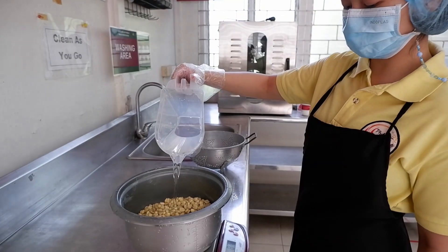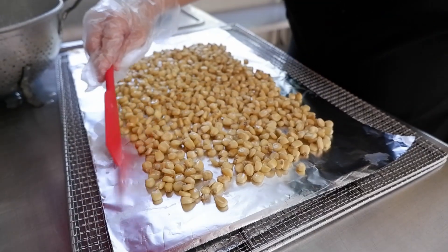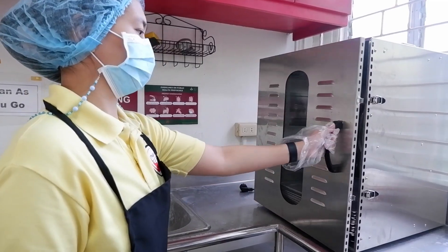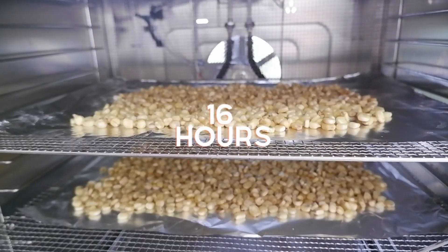Afterwards, the nixtamal is drained and washed to get rid of any extra alkali. The nixtamal is then dried in a benchtop dehydrator for 16 hours.